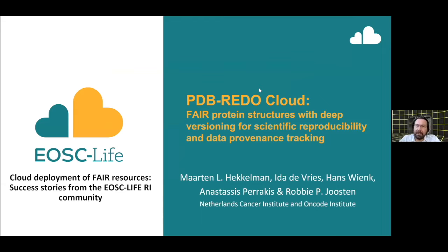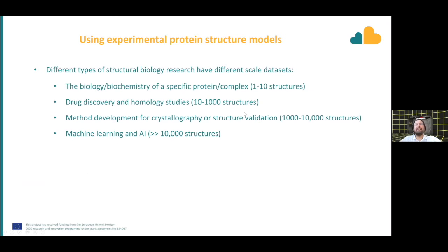Okay, thank you. I'm going to talk a bit about PDB-REDO Cloud, and it's all about structural biology and reproducibility. Okay, so imagine that you're doing a structural biology study, and you typically use experimental structure models.